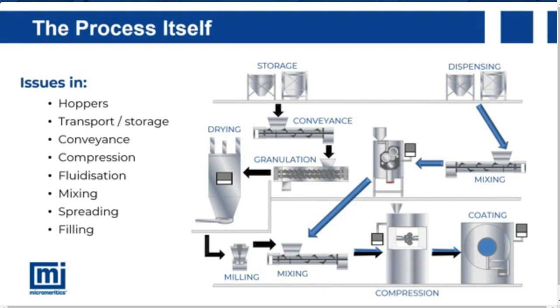These granules then need to pass through a number of different sub-processes, after which they may undergo a number of chemical and physical changes and be dependent on various different properties. This shows us that we cannot simply measure a powder at the beginning of a process, or even a single stage within the process, if we want to get the best out of our system. Instead, we need to examine the process at various points and use this information to develop a multi-level understanding of powder behaviour.